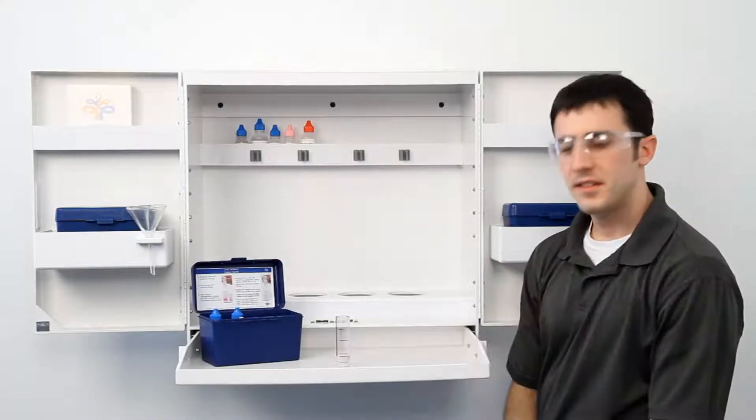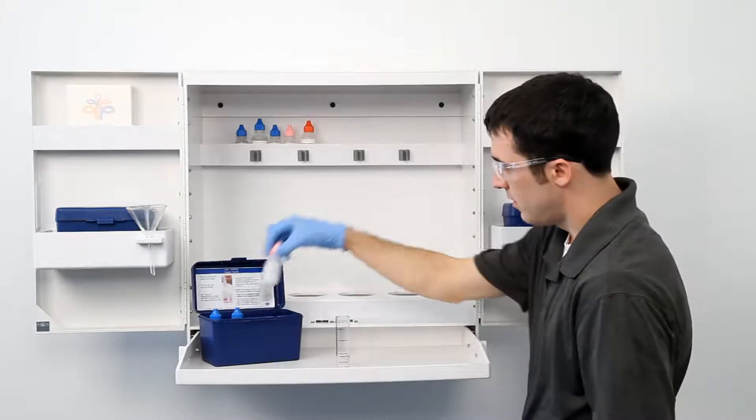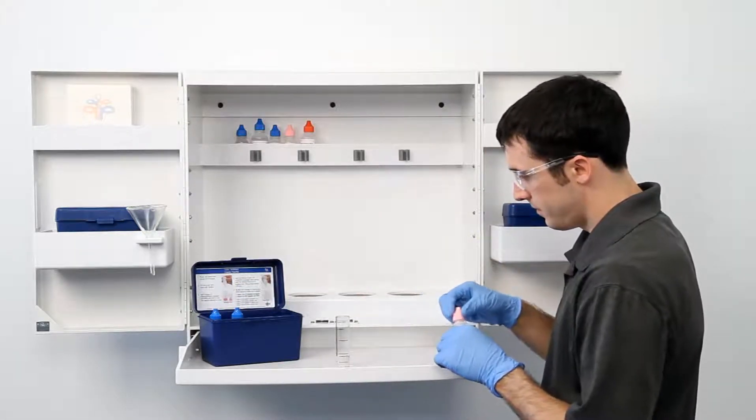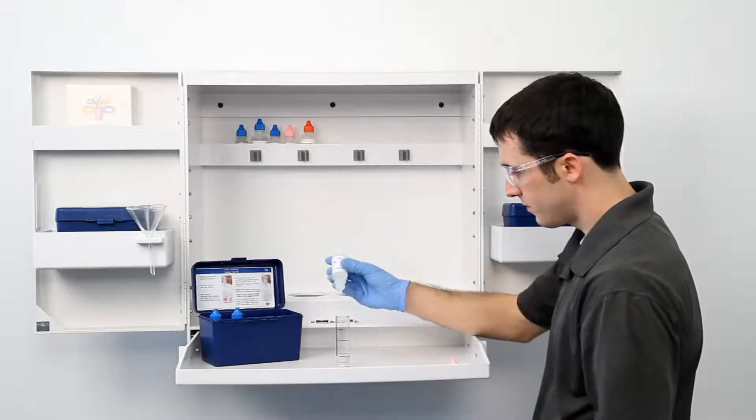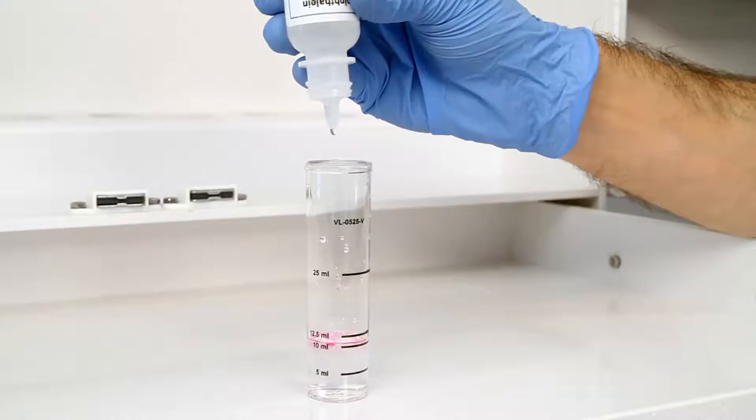Once you have gathered an accurate sample, the next step according to the Endpoint ID procedure is to add three drops of phenolphthalein indicator. The bottle contains a dropper tip, so it's important to hold the bottle vertically to get a consistent drop size.